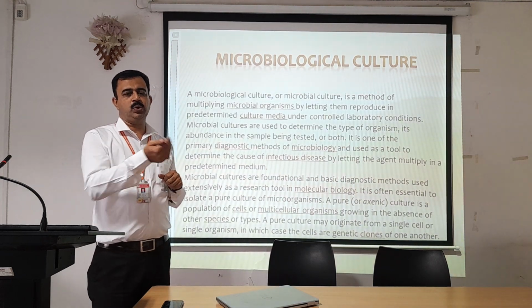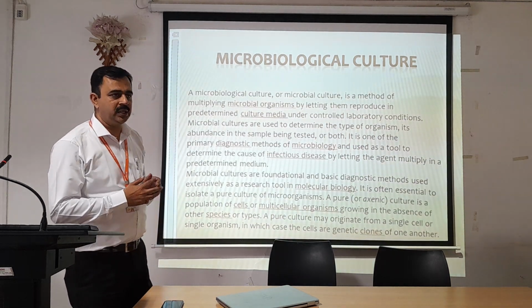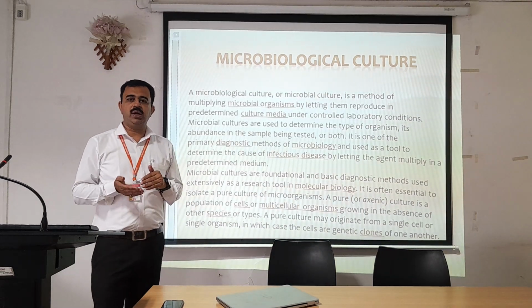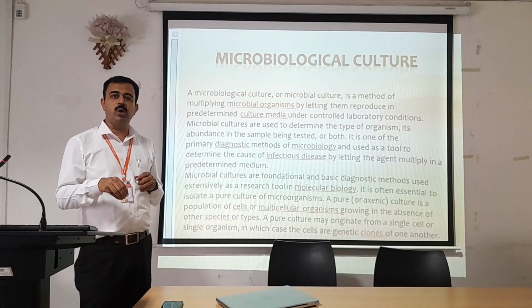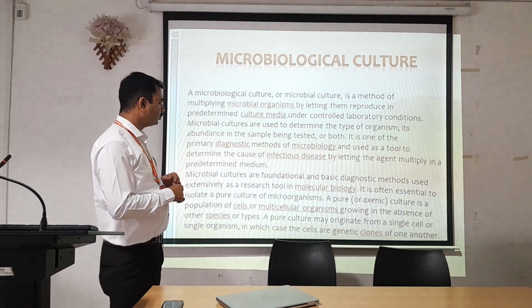Because for example, if we isolate a single organism and by mistake we lose that organism, then it is absolutely of no use to us. So therefore, in order to increase the quantity of the organisms, but in a pure form also, we need to work with this kind of method.